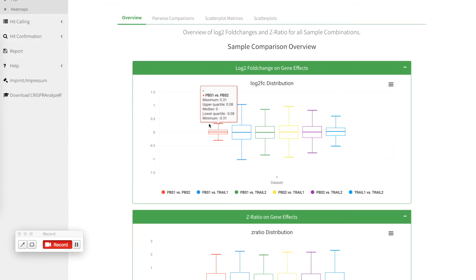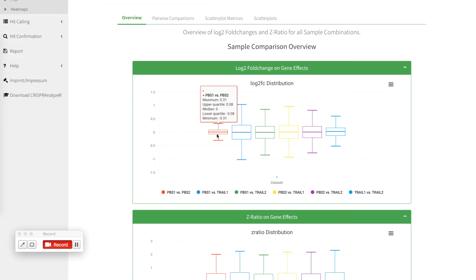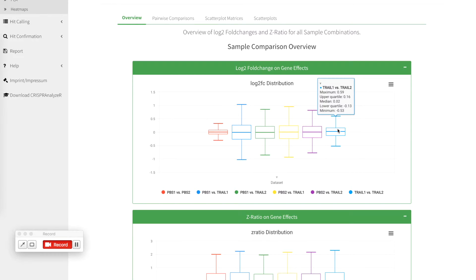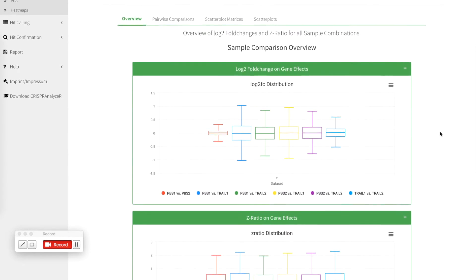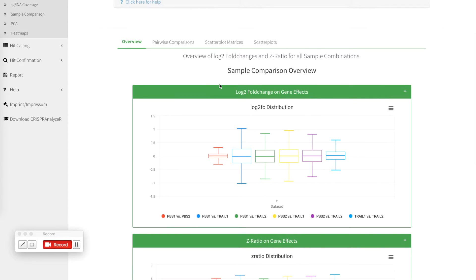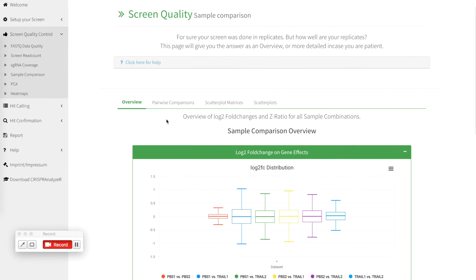And again what you see here is that if you compare the fold changes of both replicates of the untreated group the fold changes really really low the same as if you compare the two treatment groups. But it is higher if you compare between the treatment groups and between the treatment groups.